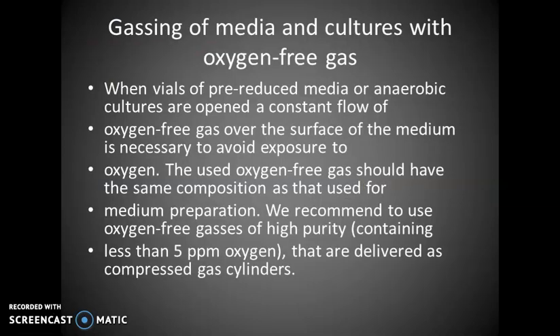Next is gassing of the media and cultures with oxygen-free gas. There are certain types of culture media in which gases other than oxygen are introduced. When the vials of pre-reduced media or anaerobic cultures are opened, a constant flow of oxygen-free gas over the surface of the medium is necessary. Why? To avoid the exposure to oxygen.